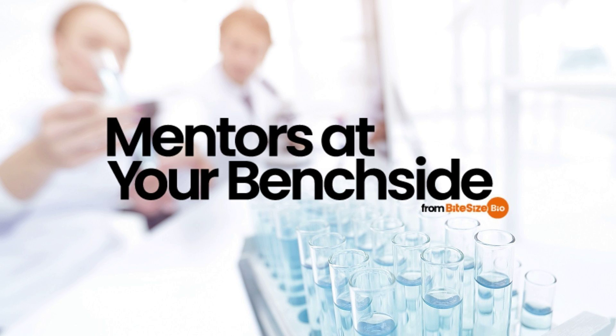Once you know the specific growth phase at which you need to harvest cells, be sure to perform a couple of test runs, including measurements, to make sure you are correct in your assessment of the bacterial growth timing. This will give you a strong sense of how long it takes for your culture to be ready to harvest and provides historical data for comparing bacterial culture growth curves. Always start from a smaller seed culture to get reliable and consistent growth in flasks. Finally, test your cell culturing techniques a few times until you're comfortable to reduce the risk of contamination.